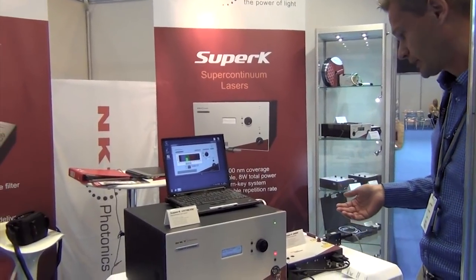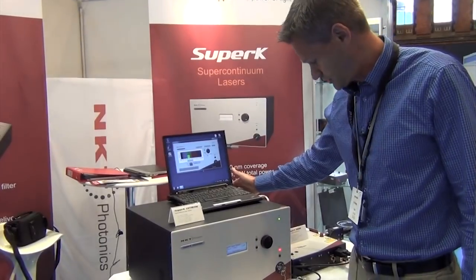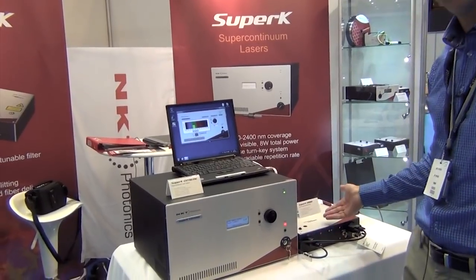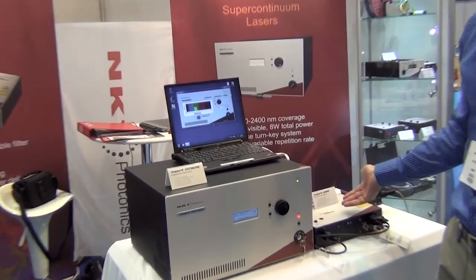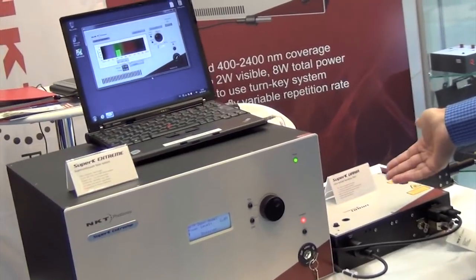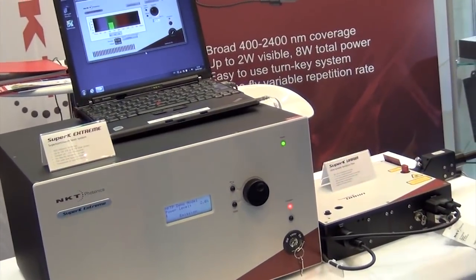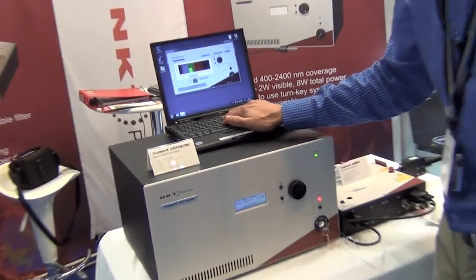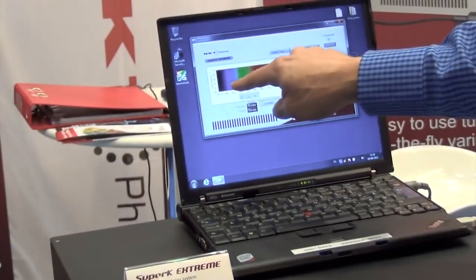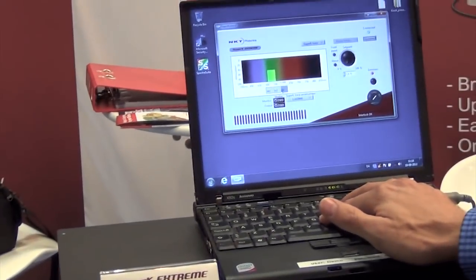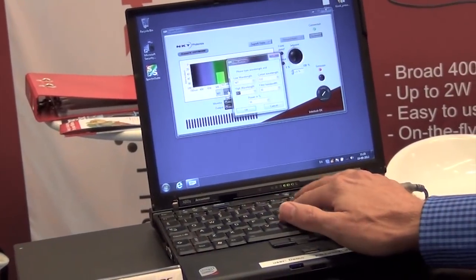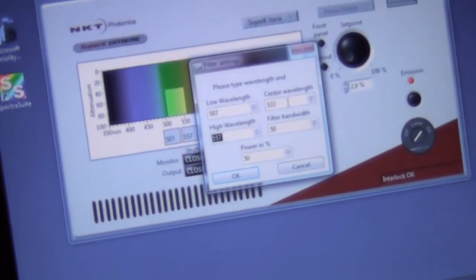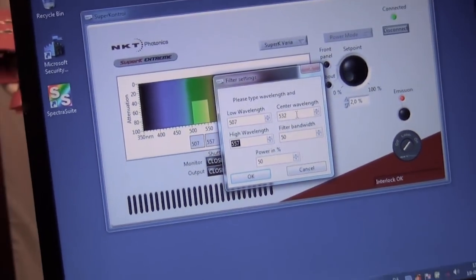From this white light source you have the raw white light output which is typically launched into a filter device. What we're showcasing here is the Super-K Varia, which is a tunable filter ranging from about 400 nanometers to 820 nanometers. Here we have a part of the spectrum and the center wavelength of the filter is at 532 nanometers, which is the green light. We can adjust the bandwidth from about 4 nanometers to 100 nanometers.